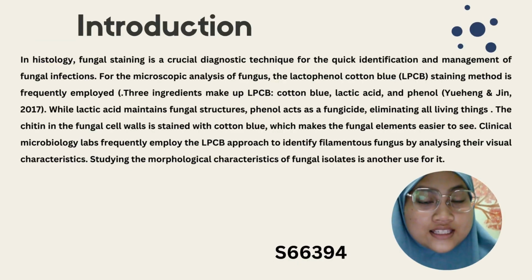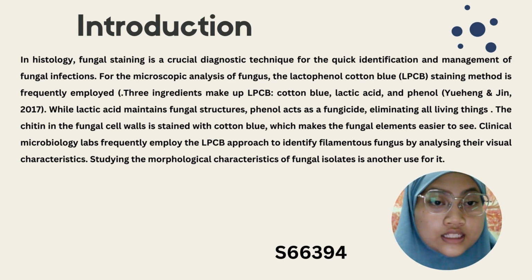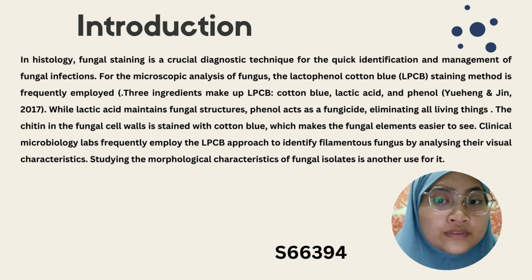In histology, fungal staining is a crucial method usually used by researchers for quick identification and management. For microscopic analysis, the lactophenol cotton blue staining method is frequently employed.